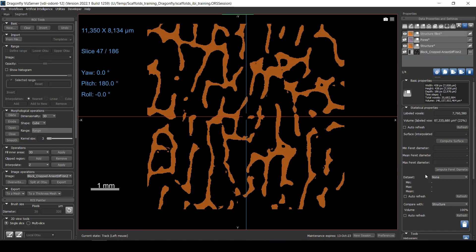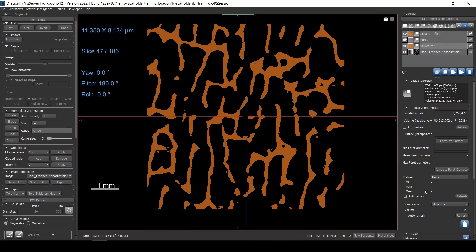Looking at the volumes when I click the filled one versus the non-filled one, they are slightly different. That's because the volume comparison shown here uses integer numbers — it doesn't use any decimal places. So if you want the real figure, you need to get the actual numbers another way.